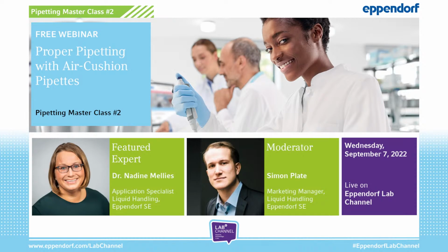Our webinar today is the second episode of our Pipetting Masterclass series, where we cover different facets of liquid handling, from manual pipetting to lab automation. As part of the Pipetting Masterclass, we will hold a total of 7 webinars until February 23. You can always rewatch all episodes after the live stream in the past events section here in the Eppendorf Lab Channel. Today, we want to show you a few tips to improve your pipetting technique.